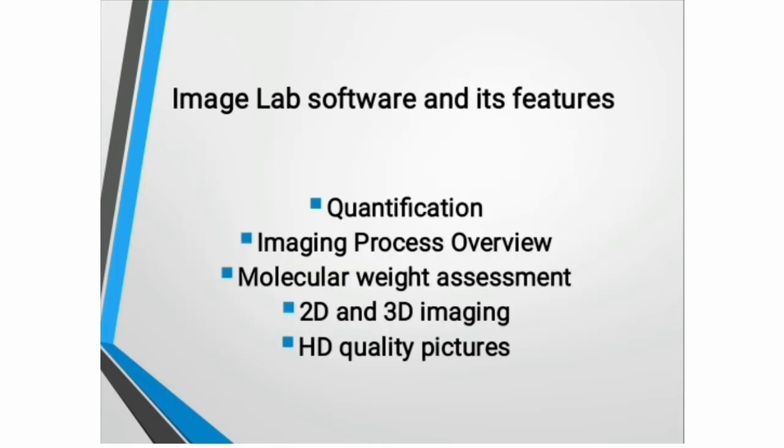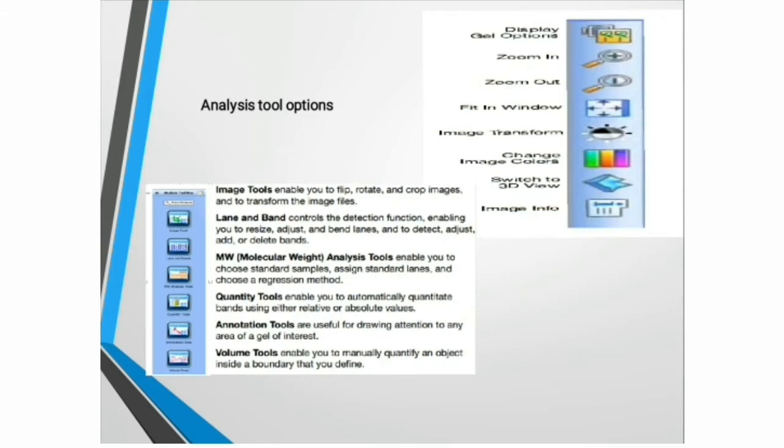The Image Lab software and its features. The features of the software are quantification, imaging process overview, molecular weight assessment, 2D and 3D imaging, and HD quality pictures. These are the analysis tools, gel display options: zoom in, zoom out, fit in window option, image transform, change color option, switch to 3D view, image info.